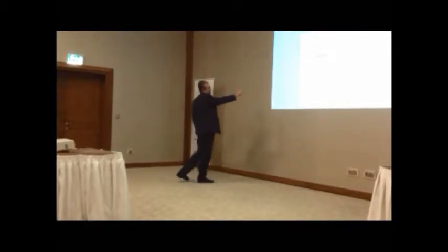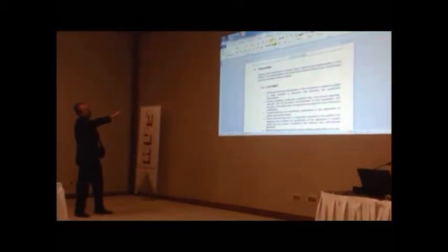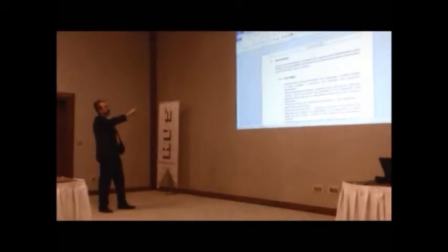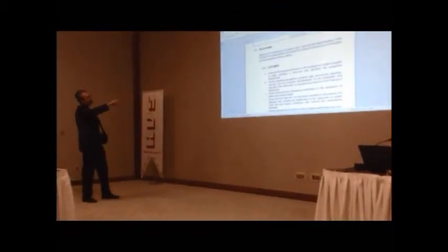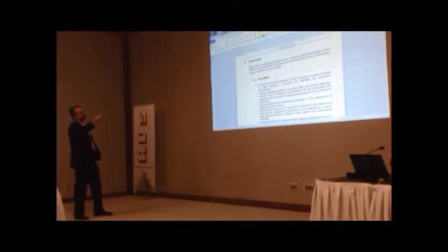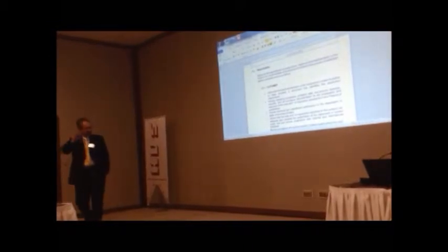The customer has a responsibility to define the functional specification and equipment, to provide operating procedure, analytical data, process drawing, provide technical support and preparation of the draft of the protocol status, ensure that the tests and inspections described in the protocol are adequate and complete the qualification for the equipment system, and review and approve the protocol before starting the qualification test.